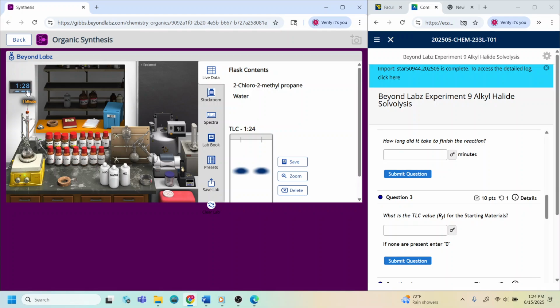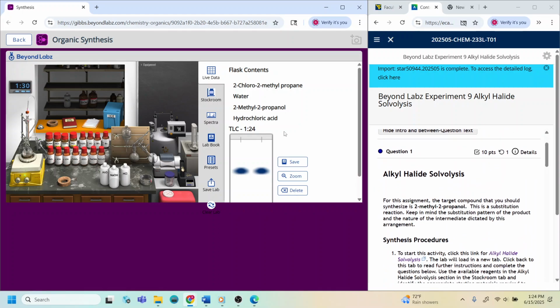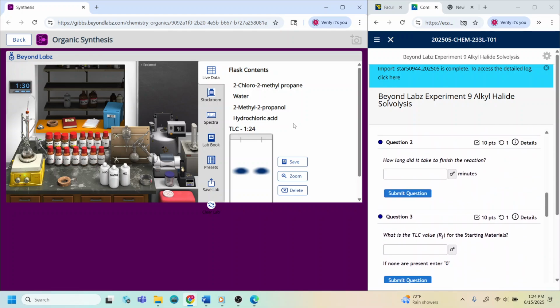Okay. I'm going to start by processing the reaction, increasing the time by 1 minute, and see, I formed my product in there, which is the 2-methyl-2-propanol. So always take a look at whatever you need to form in there and make sure that you formed it. Now, we want to push the reaction to completion, right? We don't have any organic compound other than this guy over here. So I believe that the reaction has stopped. Let's go ahead and do another 10 minutes. So we did 20 minutes. After 20 minutes, just on the safe side, we did form our product.